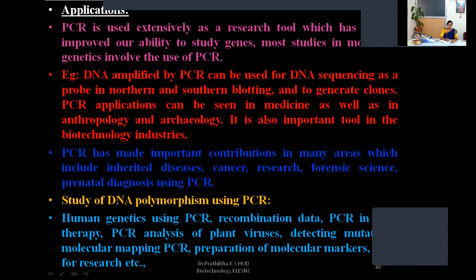And nowadays, it is a trend that we are using different types of PCR to detect this particular COVID virus, where we use RT-PCR. We have different types of PCR. For example, we have real-time PCR, and this is the traditional PCR we have, and we have the RT-PCR.